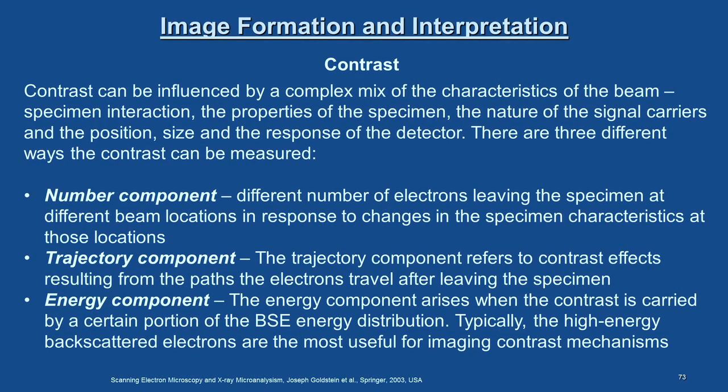So, all these features we have discussed in detail in the last class, and we have also introduced the origin of the contrast from the specimen. So, today we will just continue from that point. I just mentioned the kind of parameters which are involved in the contrast, we will go through those points again.